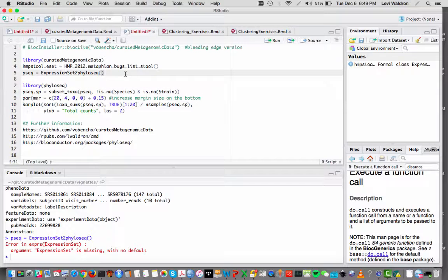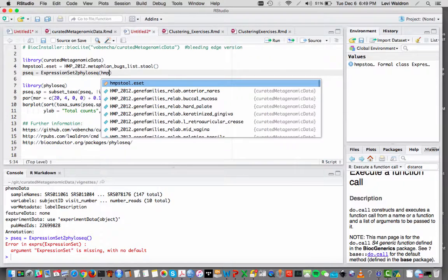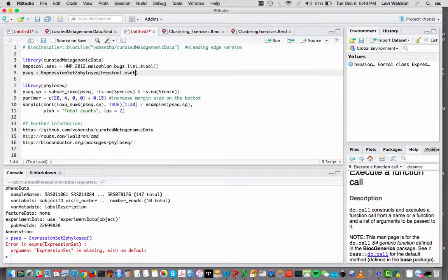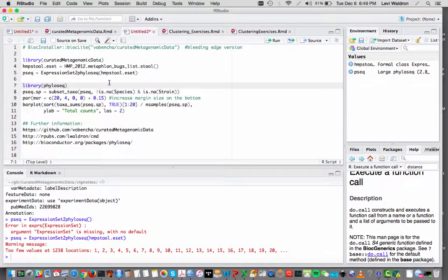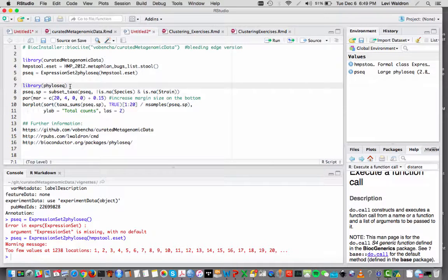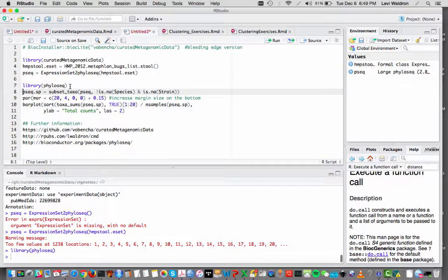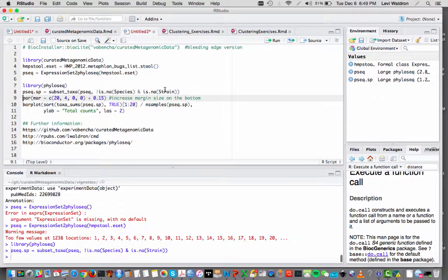And I need to put in the name of the expression set. Don't worry about this.